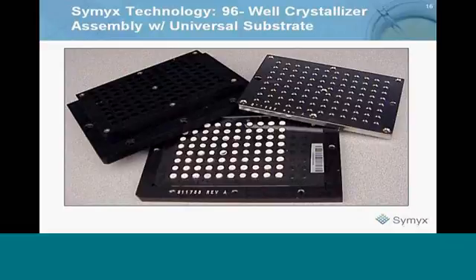We then can transfer over a variety of different solutions. We can do different types of crystallization processes in these wells, generate different types of crystals, isolate out, remove the solvent, and what you're left with is solids that have been isolated on a glass substrate. That glass substrate can then be removed from this crystallizer, and it has a barcode, so when you take it to different stations, you can scan in the barcode, and you can do microscopy analysis. You can then take that same plate and go on to do Raman analysis. You can then take that same plate and go on to do X-ray analysis. So we're getting a variety of analysis, and all the analysis happens off the exact same set of samples.